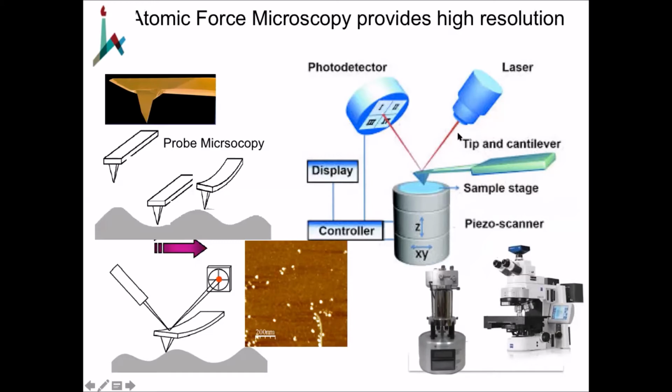However, when this AFM idea is integrated with near-field optics, and if you built a machine that could be totally integrated into an optical microscope, AFM already is contributing to giving you optical super resolution. I wouldn't call it a naive thing, but it's basically showing how these techniques are synergistic with one another, okay?